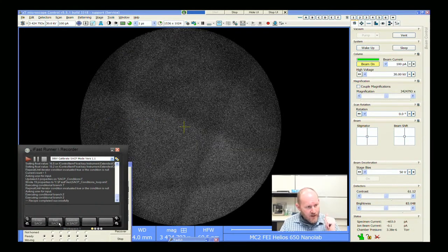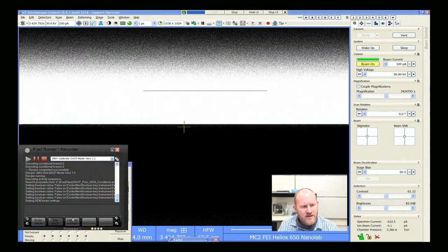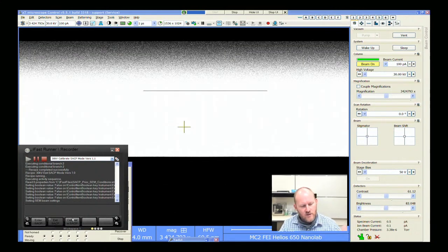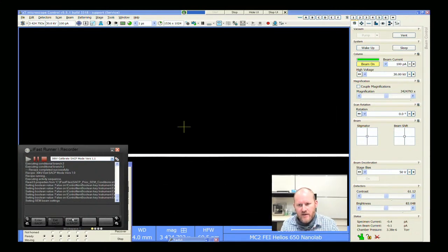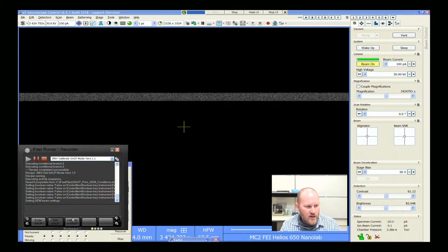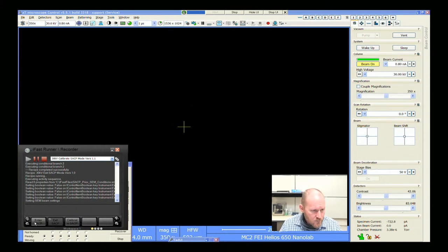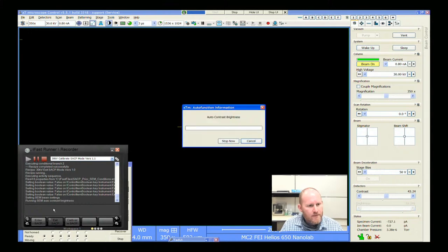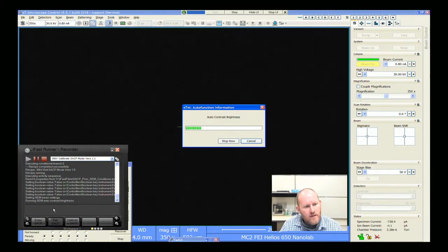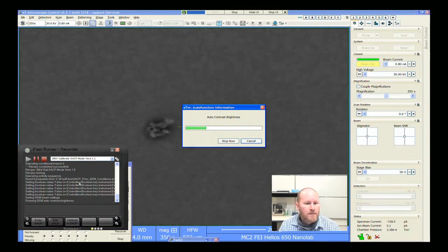So I can now exit SACP mode. When I exit SACP it just reverts back to the object model — it goes back to standard imaging. When I enter SACP mode, it's going to use those values that we calibrated.